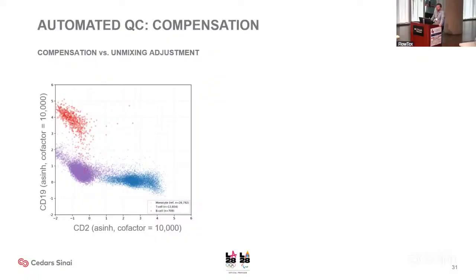And on these far ends of the detector channels is where we see that drift. But you can see pretty clearly here that the unmixing is not performing perfectly between the two, and we see it both on T cells and B cells here. So we tried to think about what is a way we can do automated compensation, or unmixing, more so automated compensation, on these samples.